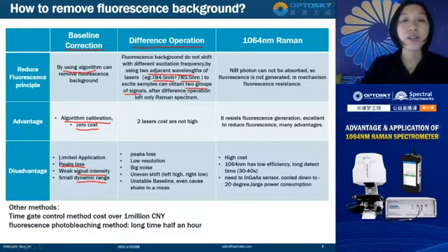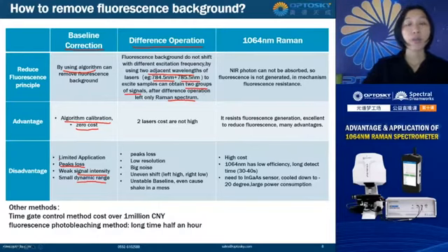By a difference operation, only the Raman spectrum is left. Because the laser cost is not high, its advantage is that the cost is not high.